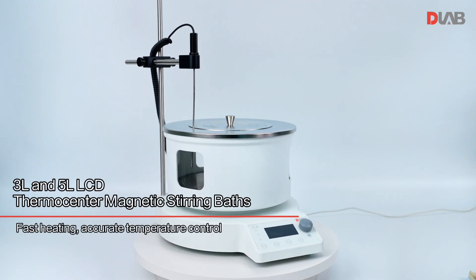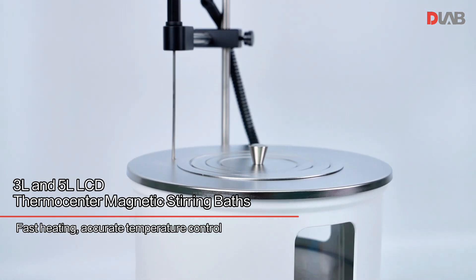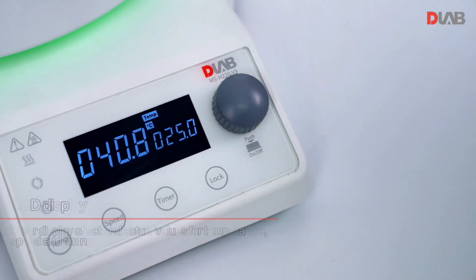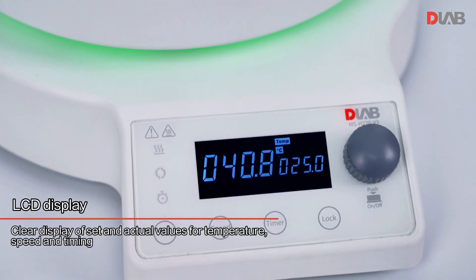3.0L and 5.0L LCD Thermocenter Magnetic Stirring Baths. Key features include fast heating, accurate temperature control, and an LCD display showing clear display of set and actual values for temperature, speed, and timing.